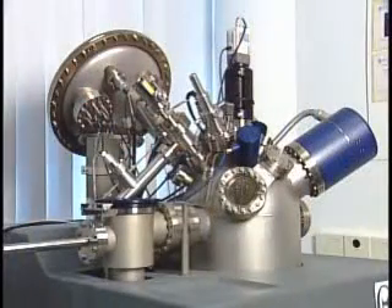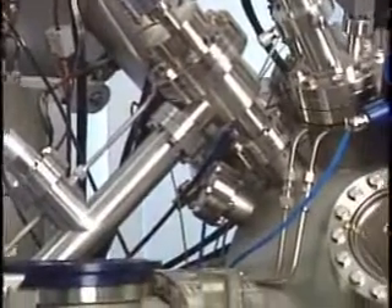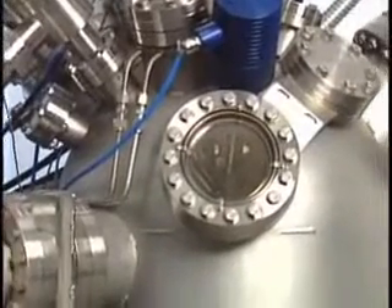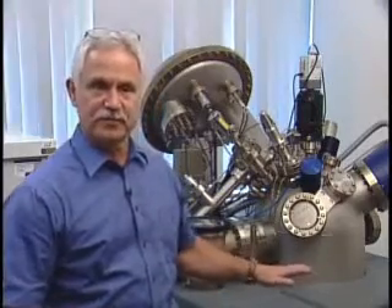This tool is called an x-ray photoelectron spectrometer. What it essentially does is bombard a surface with x-rays, creating secondary electrons. We collect those electrons and measure their energy as well as the number of those electrons. By knowing that, we can back calculate the composition of the surface that we're bombarding.